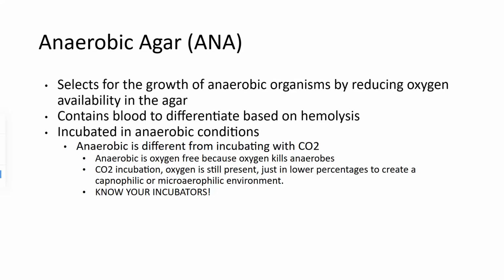Anaerobic agar, or ANA, selects for the growth of anaerobic organisms by reducing the oxygen availability in the agar. It contains specialized substances that will reduce oxygen's ability to be inside of the agar itself. It contains blood to differentiate based on hemolysis.